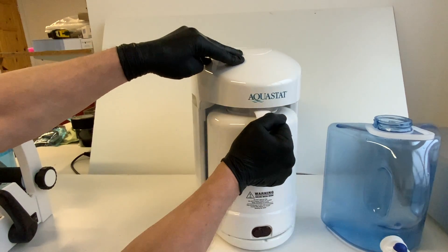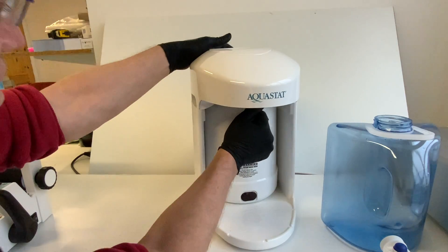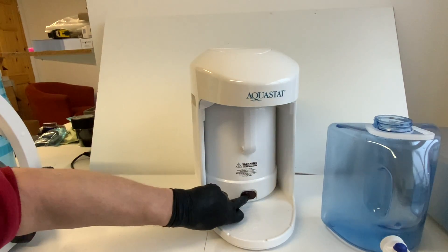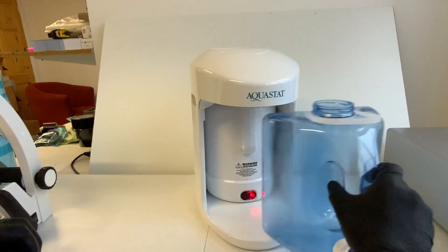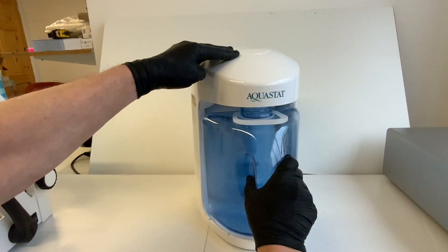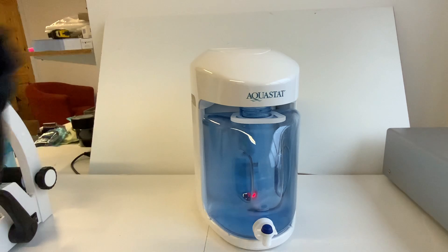You place the jug firmly, push, press the button to turn it on, and then the water container can be placed in position.